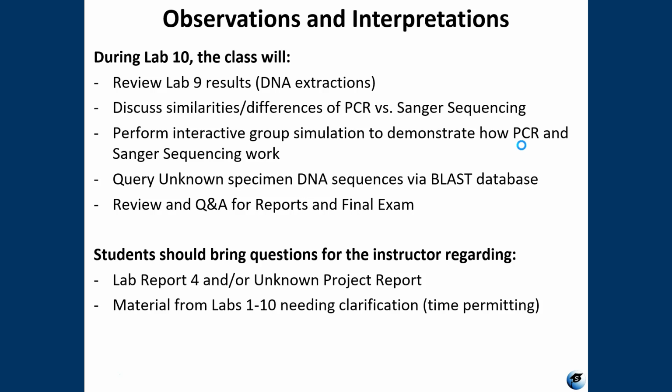In Lab 10, we do not have a wet lab procedure. It's the last time that we meet before your project reports are due, before the final exam and all that. But we're going to do a lot, so you need to make sure that you come to Lab 10. We're going to review the Lab 9 DNA extraction results all together. We're going to discuss the similarities and differences between in vivo DNA replication, in vitro DNA amplification, and Sanger dideoxy DNA sequencing. We're actually going to do an interactive group simulation.